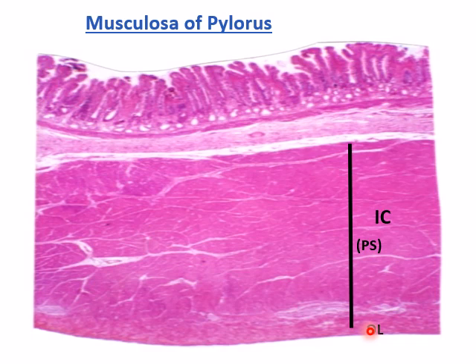Number 3, the pit to gland ratio in the fundus is 1 to 3, and in the pylorus 1 to 1. Number 4, most of the cells in the pyloric glands are pale, as they are mucus secreting, while those of the fundus are colorful: darkly acidophilic, darkly basophilic, and pale. The muscle layer of the pylorus, the inner circular layer, is very big, forming the pyloric sphincter.